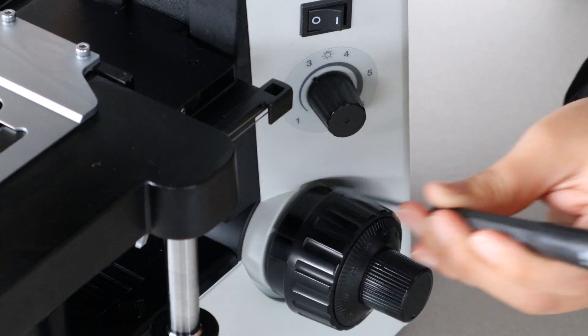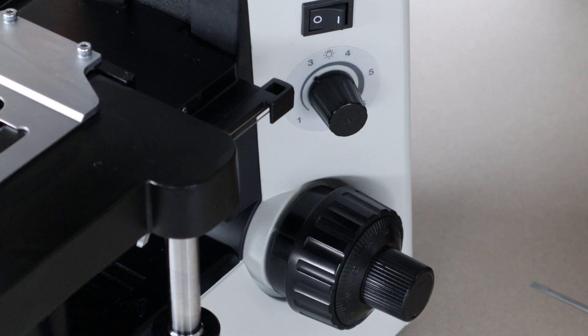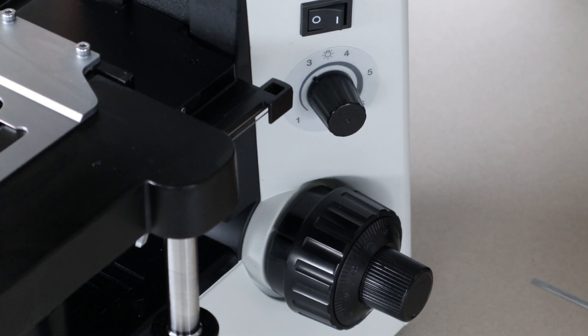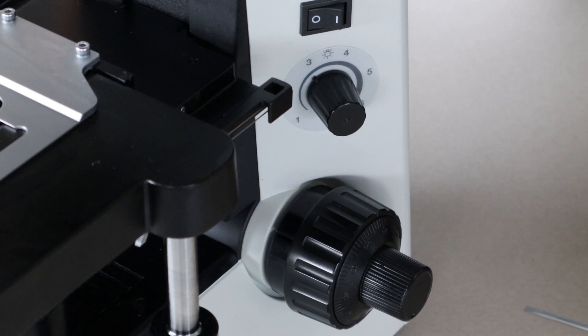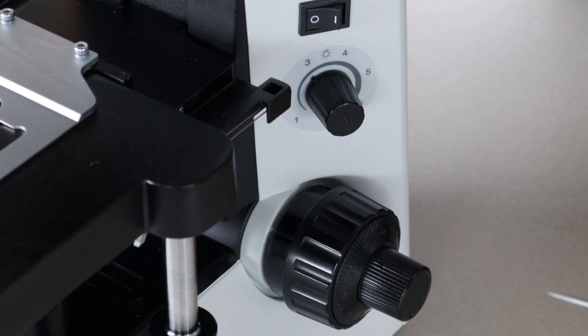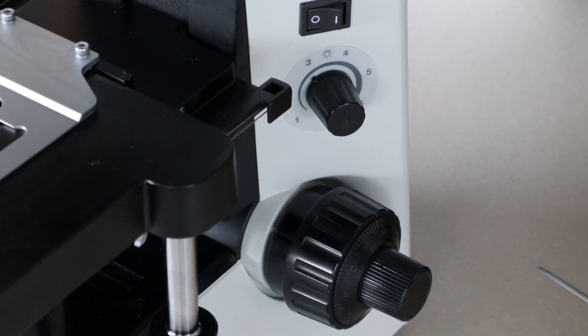And if you have the opposite issue that your tension is too loose, you're just going to stick the screwdriver in the slot and move it in the clockwise direction. You would have this issue if your specimen was falling out of focus over time.